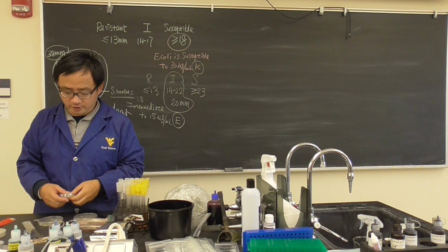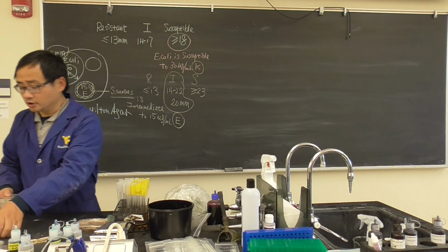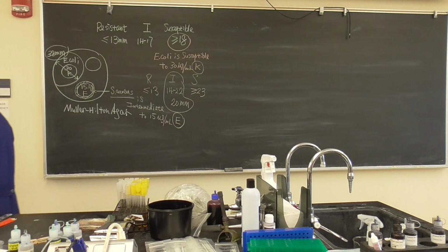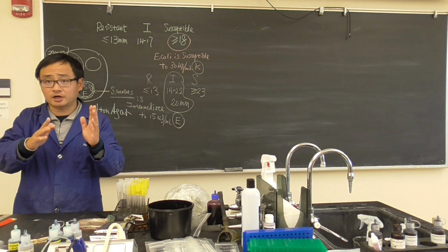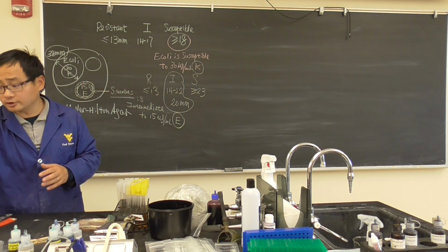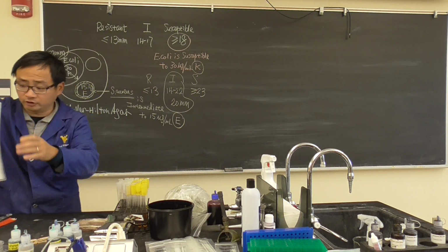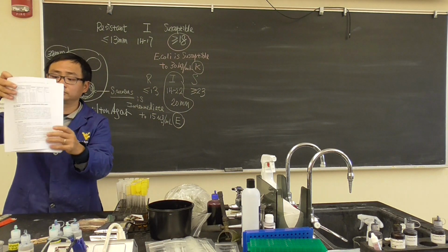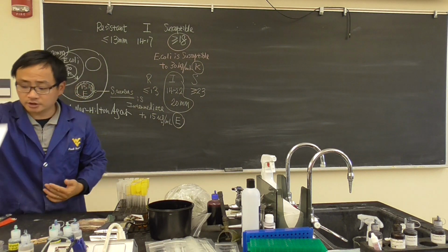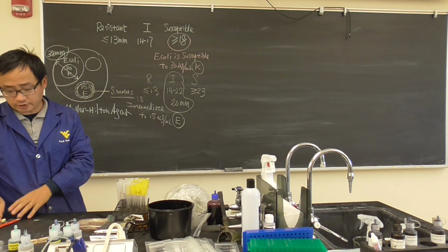Okay, I just gave you an example of how we handle these results. I would suggest you take a picture of one of the E. coli and the Staphylococcus aureus plates as an example. Write in your notebooks, then you know what's going on. And this will be the table, the full table right here. This is a typical table which I wrote in my textbook. Okay, just giving you some examples. Okay, now we're going to do today's work.